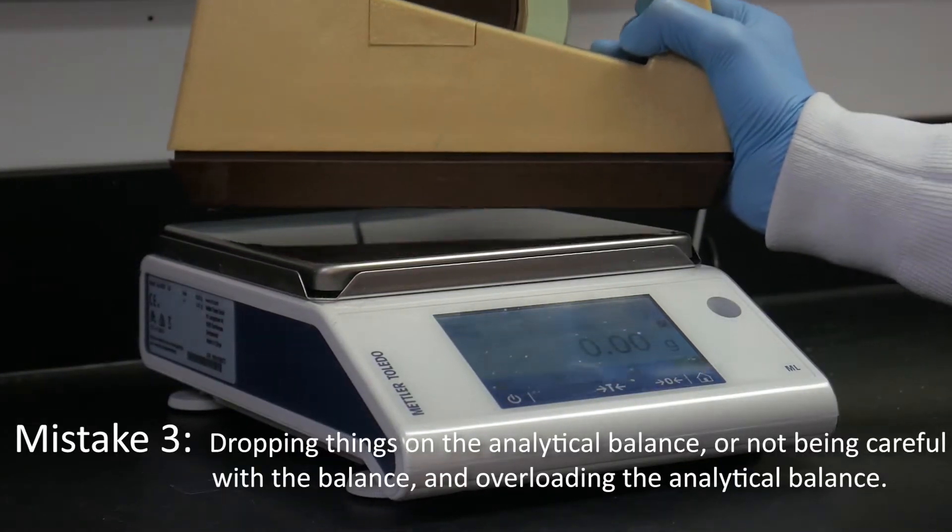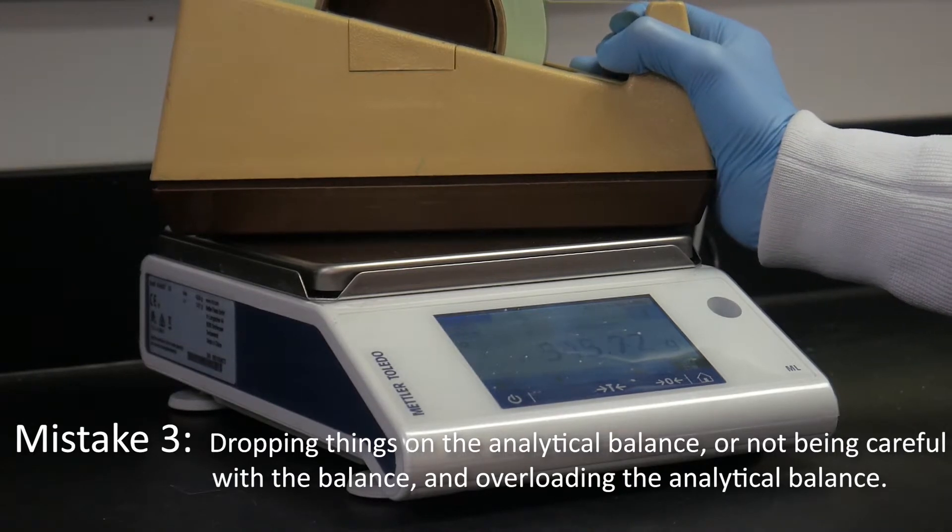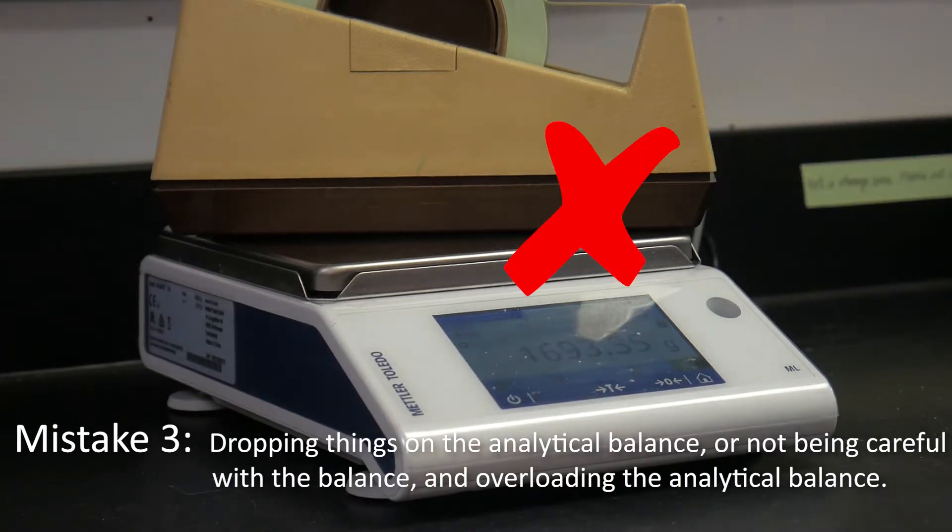Mistake 3: Dropping things on the analytical balance, not being careful with the balance, and overloading the analytical balance.